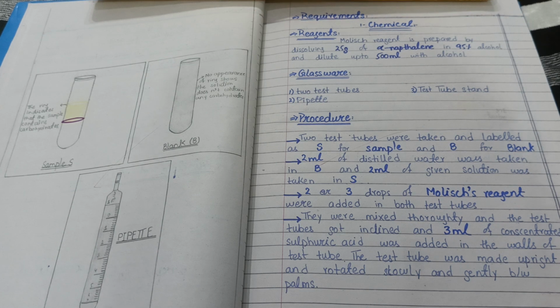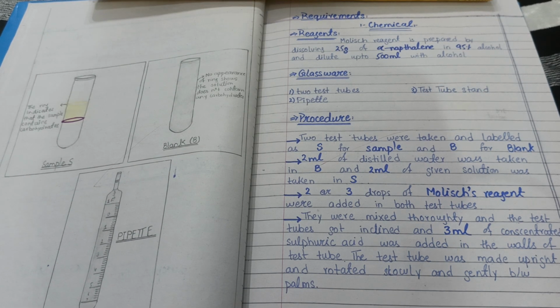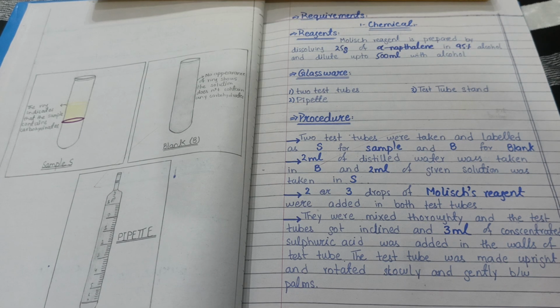One thing I want to make clear in your mind: for all the detection of carbohydrates, proteins and lipids, you need a reagent. And you have to definitely mention the preparation of this reagent, and after that you will show how the procedure is going to occur. So you have to write the preparation of this reagent.